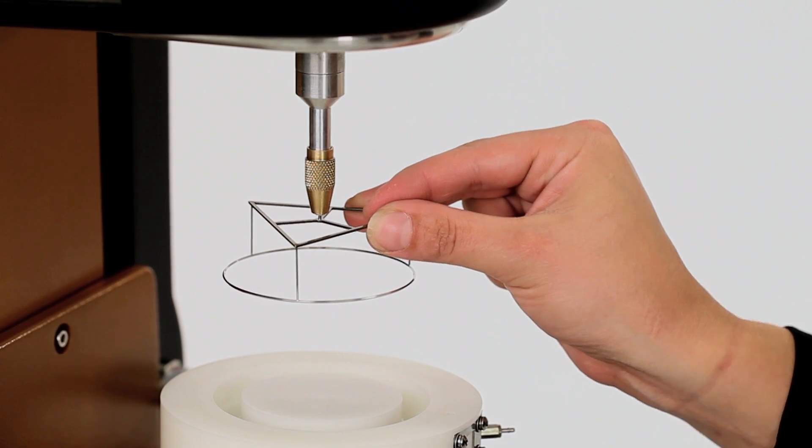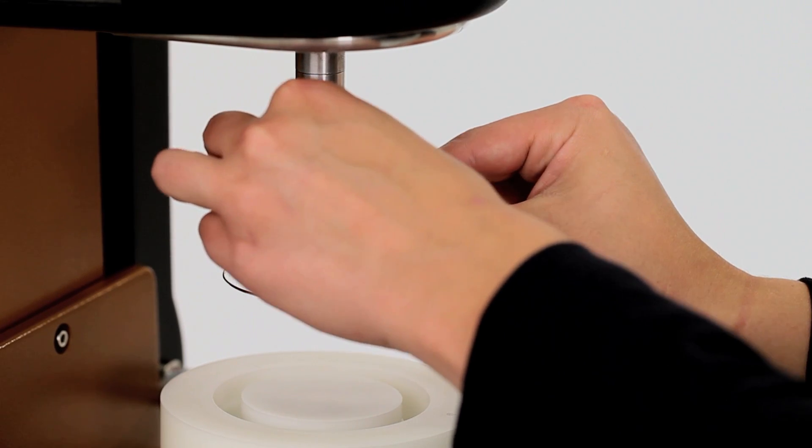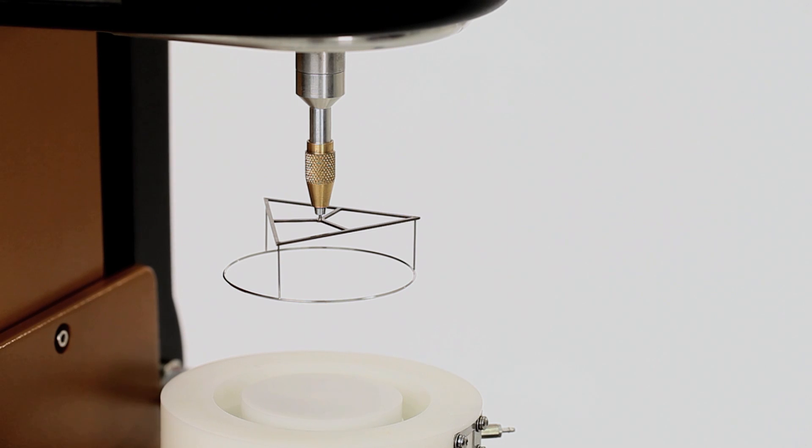Raise the rheometer head to the loading gap and insert the double wall ring into the holder. Ensure that the ring has been pushed all the way in and that the chuck is tightened so the ring does not slip.